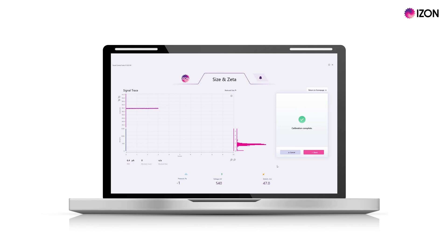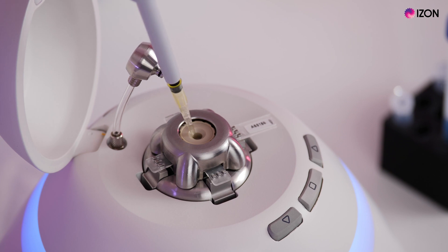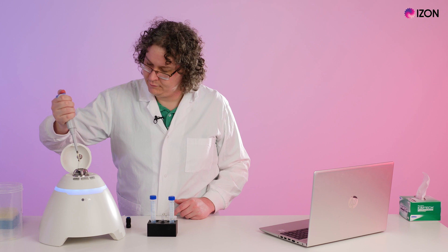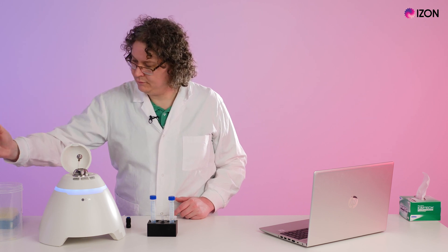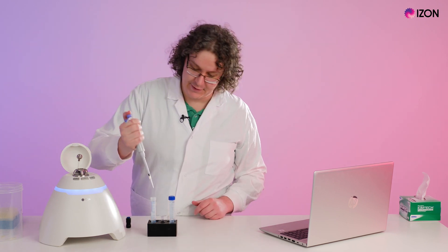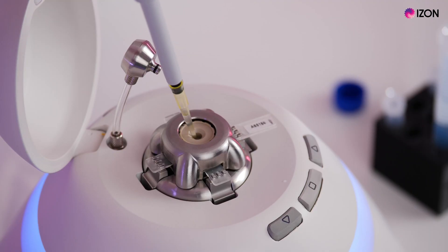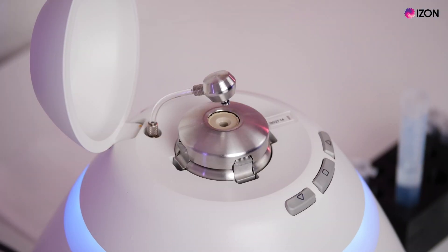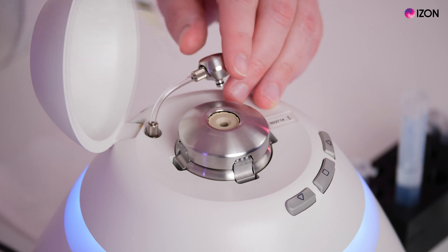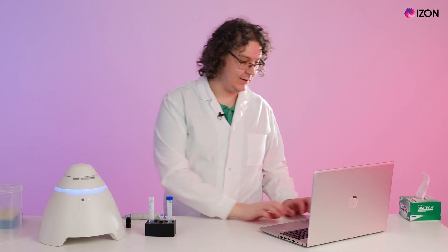Once your calibration is complete, select done to proceed. The system will now ask for you to clean the nanopore — follow the instructions on screen. Remove the calibration sample, then replace the fluid in the upper fluid cell with fresh measurement electrolyte by reverse pipetting three times. Then replace the fluid with 35 microlitres of fresh measurement electrolyte. Insert the pressure nozzle, close the lid and select OK.